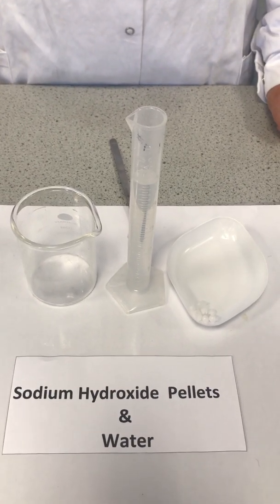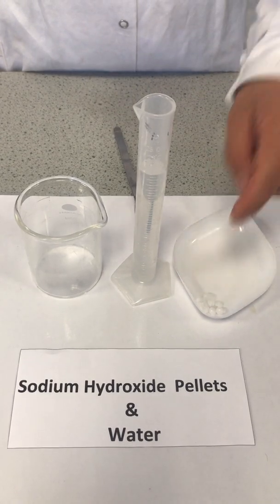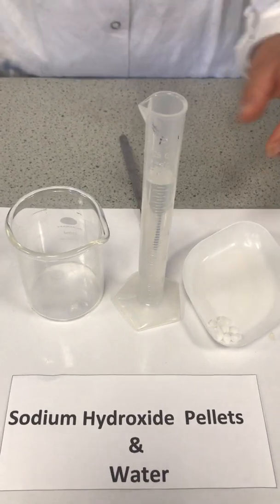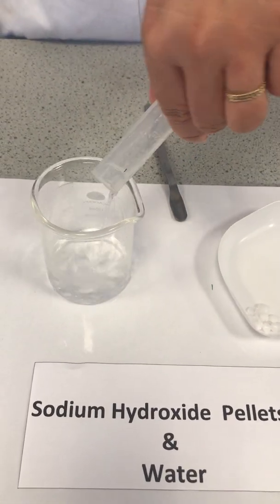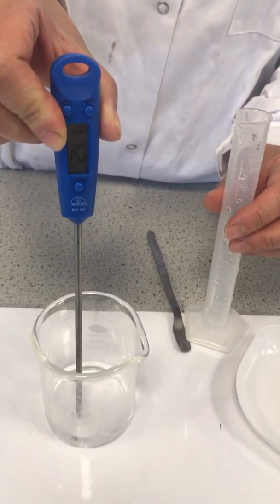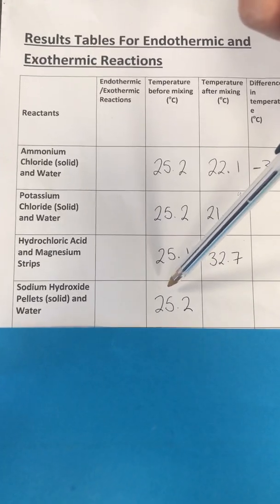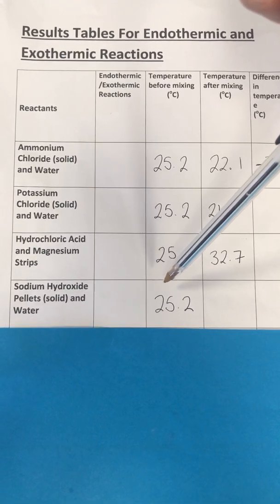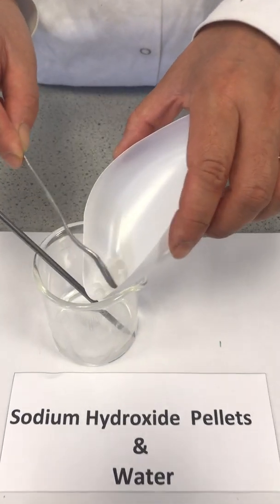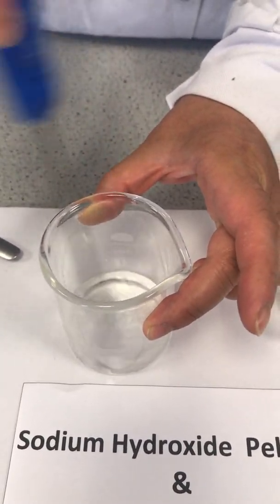Experiment 4. Reaction between sodium hydroxide pellets, which is solid, and water. Add water into the beaker and record the temperature. Now we will add sodium hydroxide pellets inside the water and we'll stir the water for a few seconds and record the temperature.